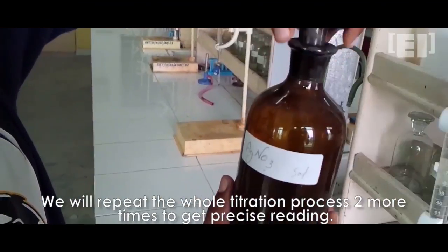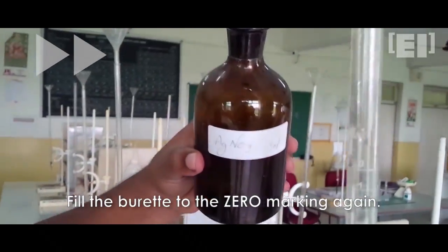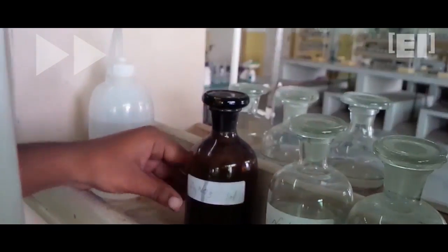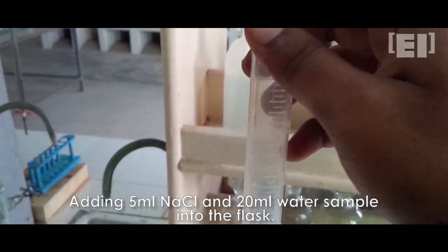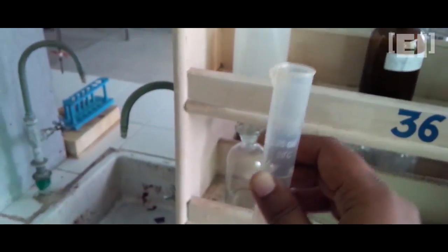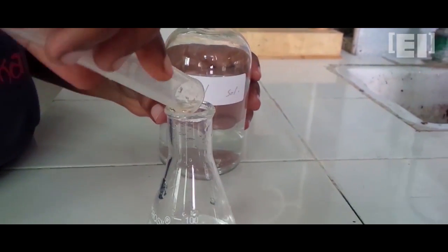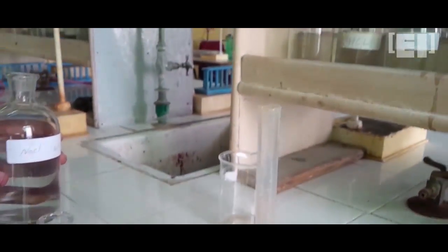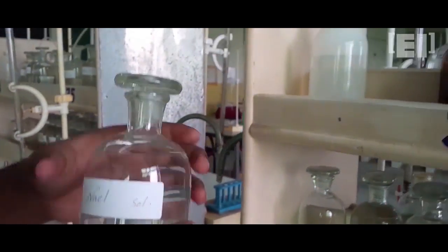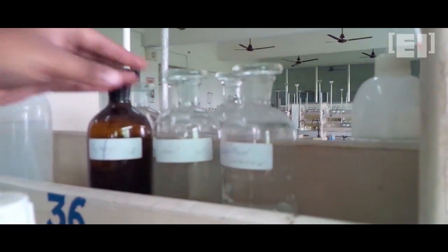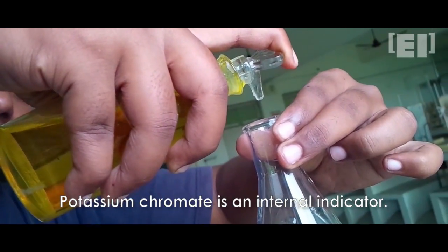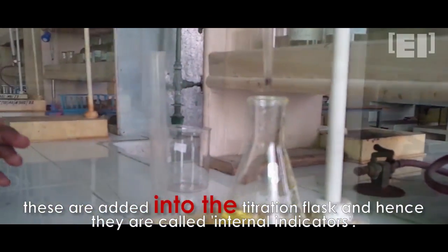Repeat the process two more times to get a precise value. Fill up the burette again and mix 5 ml of NaCl in 20 ml water sample. Pour 2-4 drops of potassium chromate into the flask and titrate it again with the AgNO3 solution.